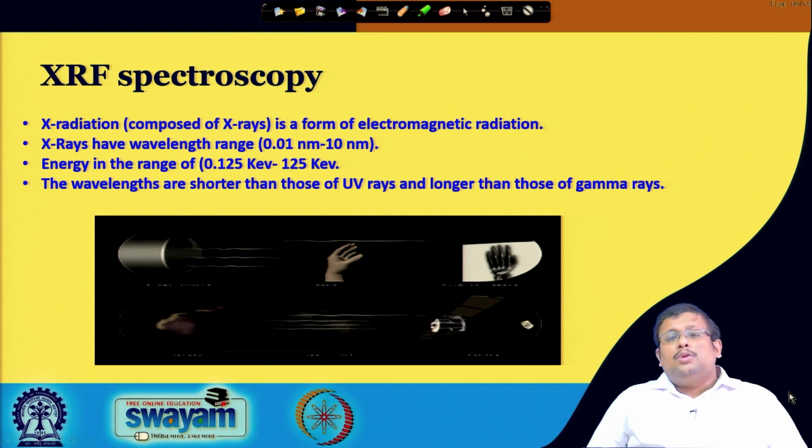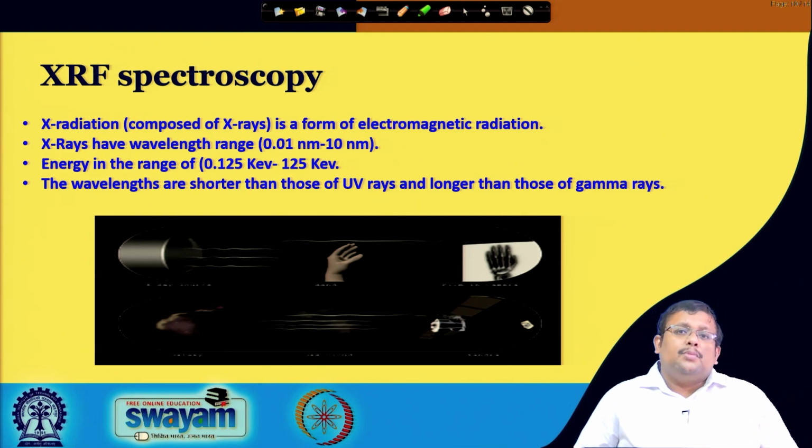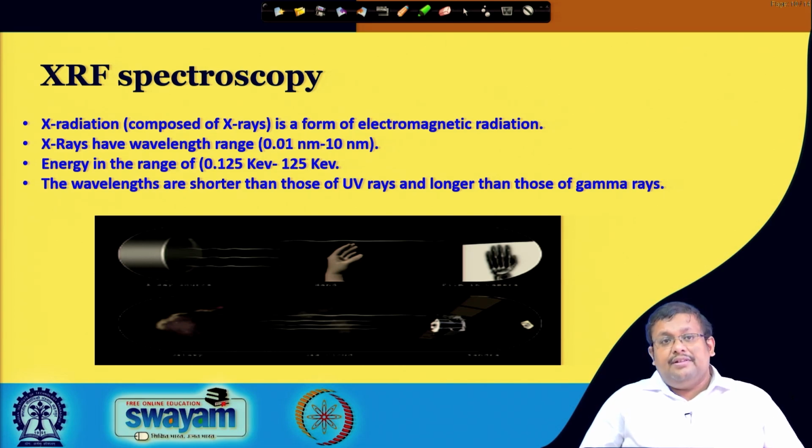Now, regarding total elemental analysis, let us talk about another important spectroscopic method, called X-ray fluorescence spectroscopy or XRF. Before going to XRF, let us talk a little bit about X-ray radiation.